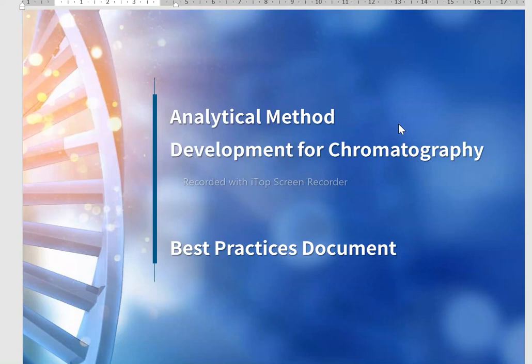That is, we have to perform the literature search. With the help of the literature search, you learn the physicochemical properties: the log P value, the pKa value, the solubility, the polymorphism, and the storage. Along with these, now we are going to discuss the next topic.